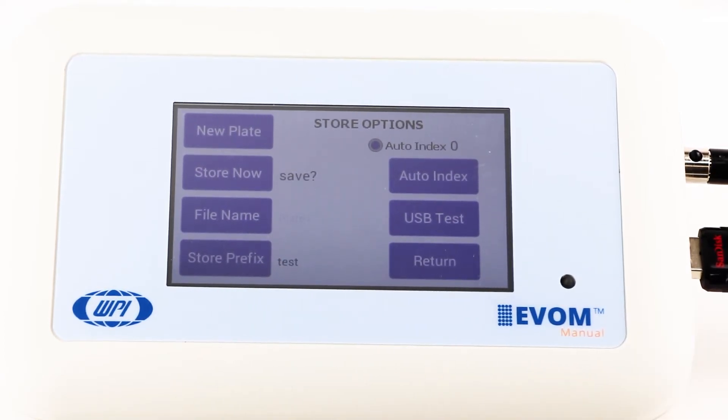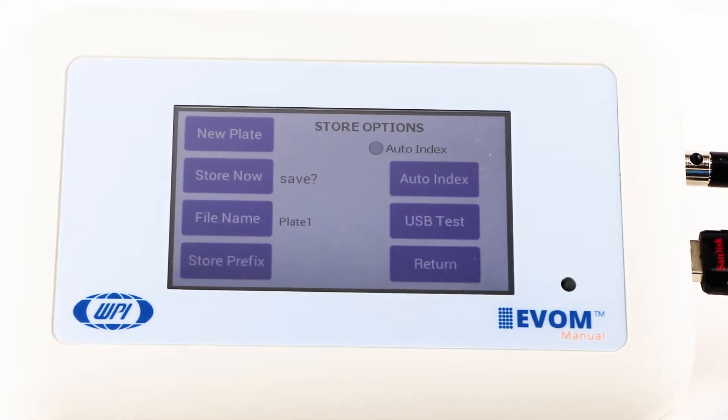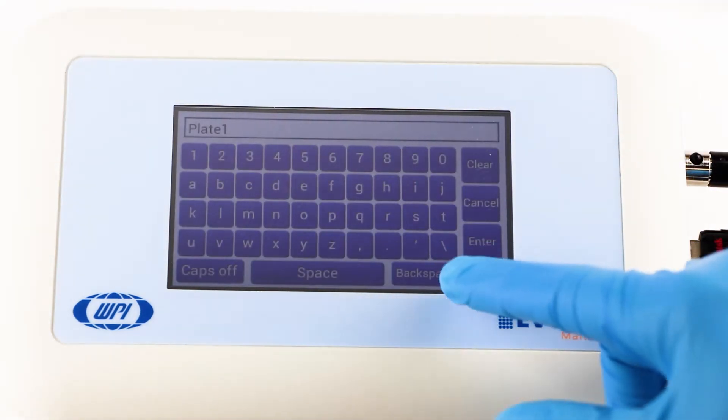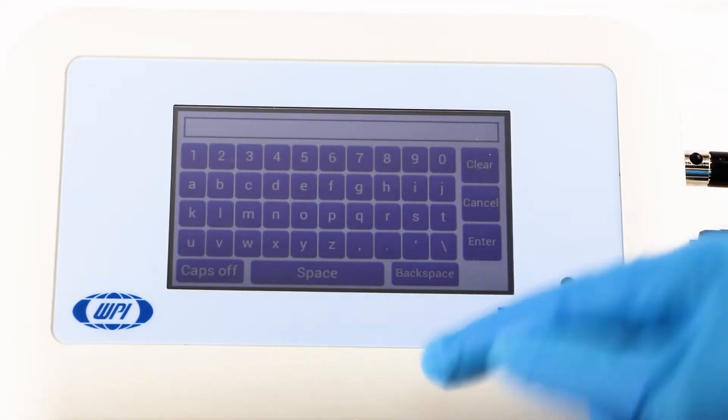Or you can use a unique file name. To do that, deactivate the auto-index radio button and then select file name to enter the name of your file. Press clear, use the keypad to enter a new name, and press enter.